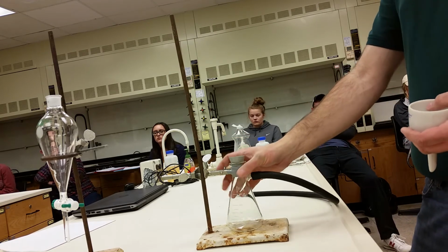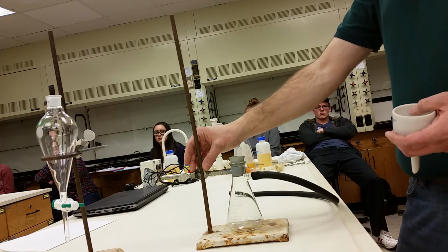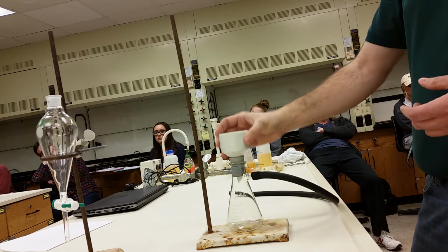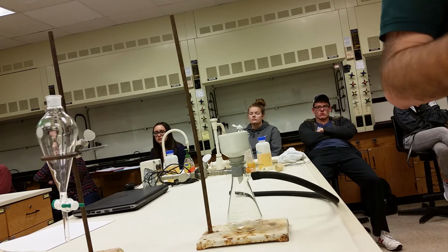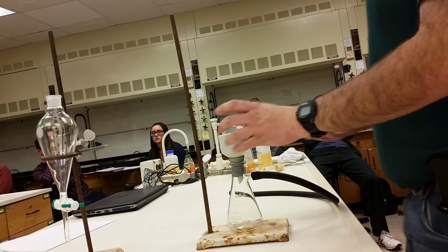You have to have the sidearm flask clamped down to a ring stand so it doesn't fall over, because when you put the Buchner on top, it's very top heavy. If it falls over, the Buchner can break, which is going to cause problems. You can get cut by it, picking it up.